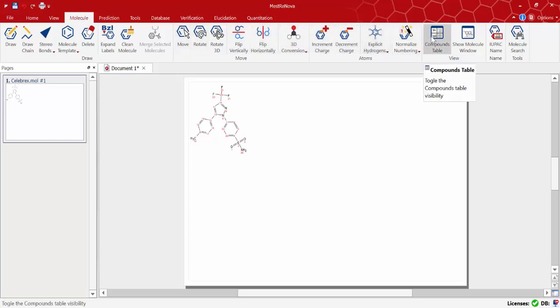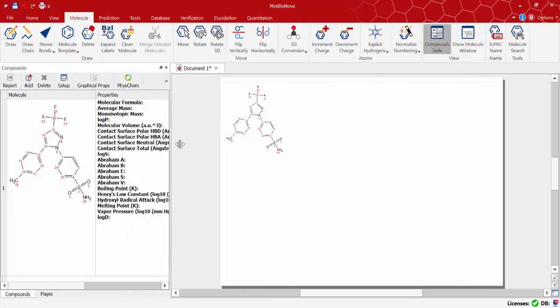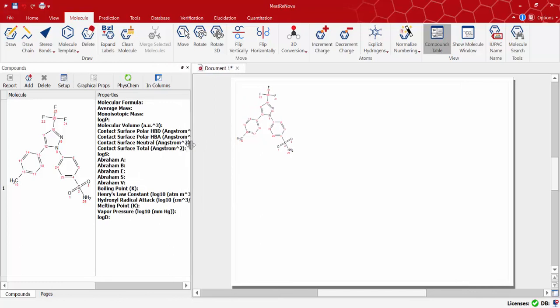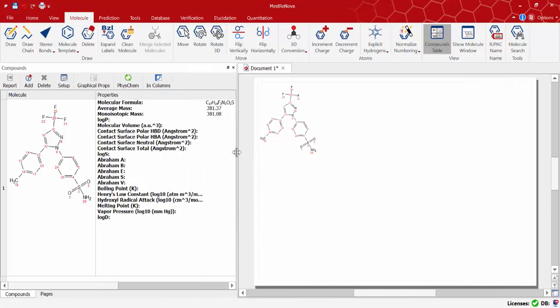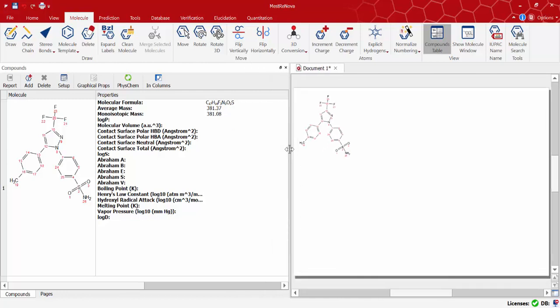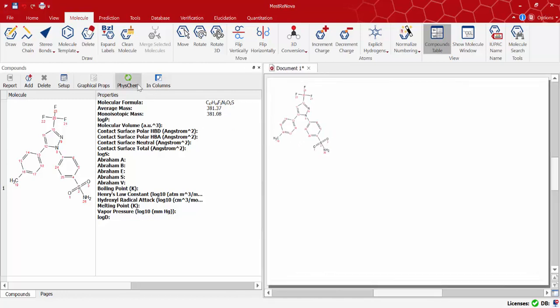Now open the compounds table using the button located on the menu bar. In this table we can see the molecule and the list of the common properties we can calculate. Now we just need to press the PhysChem button to display the values of all these basic properties in one go.